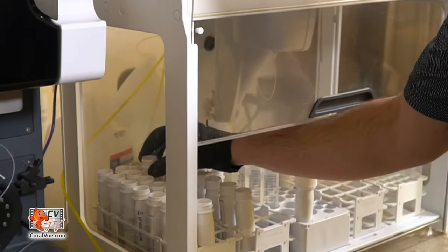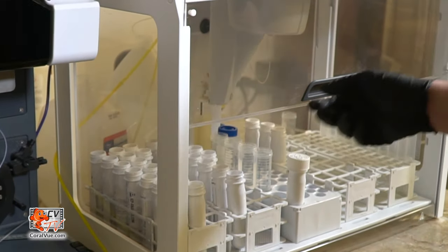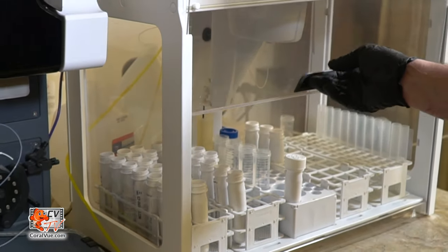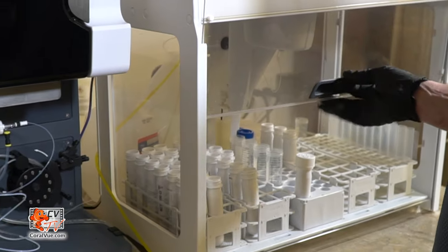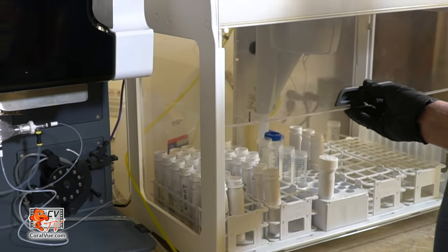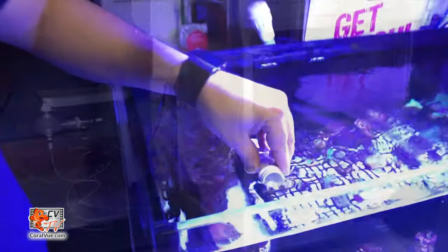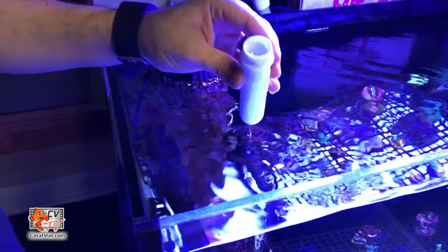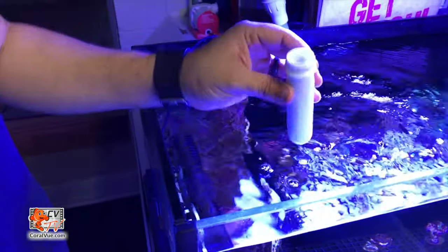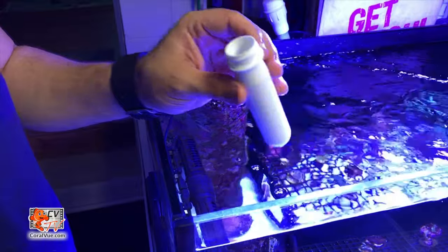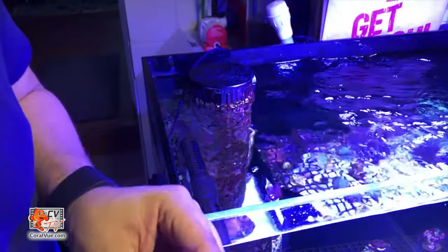The process starts by placing a water sample in a test tube that is then loaded into an auto-sampler. The sample contains water which is drawn directly from the hobbyist aquarium.